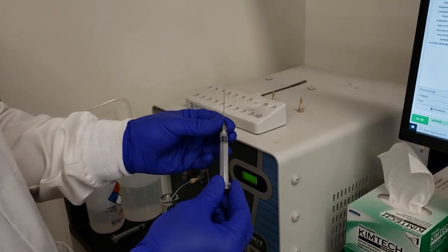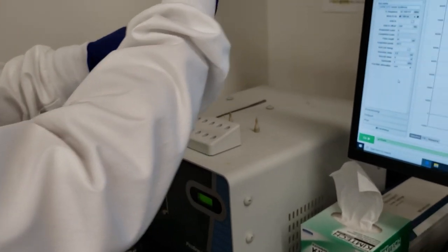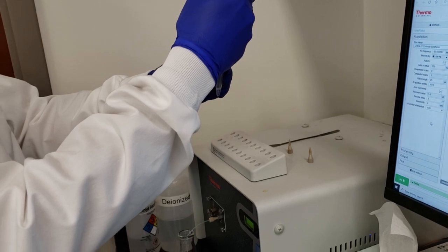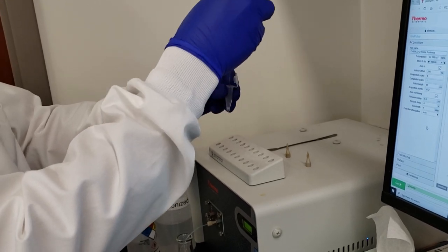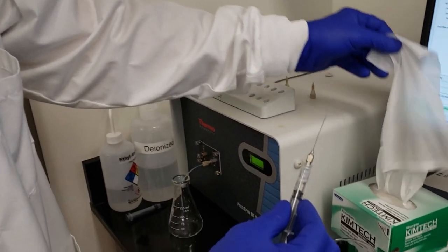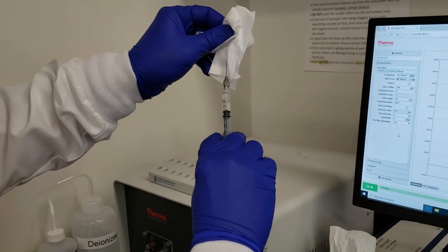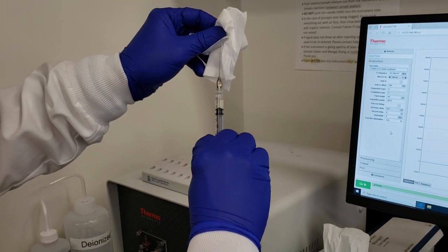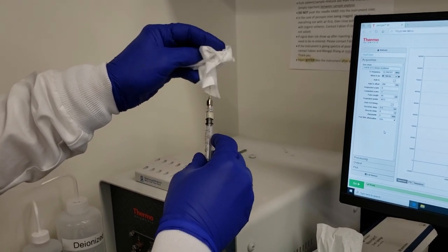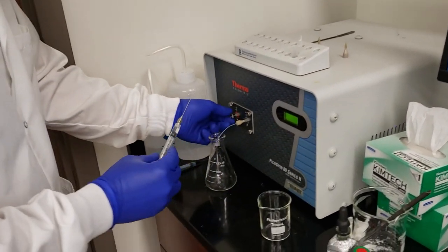New syringe, new needle. Want to make sure that we don't cross-contaminate with our DI water or anything else. Go ahead and draw up pretty much our entire Eppendorf there, just as we've done before. We've got an air bubble. Turn it upside down. I'll go ahead and push that up, because we don't want to have any air in our loop. We just want our sample solution.